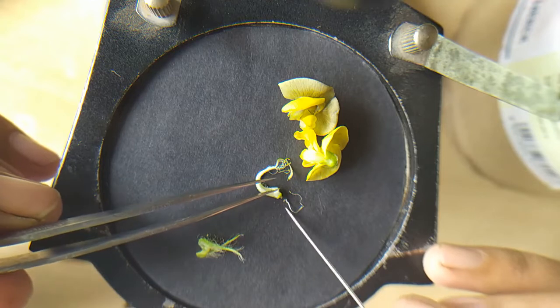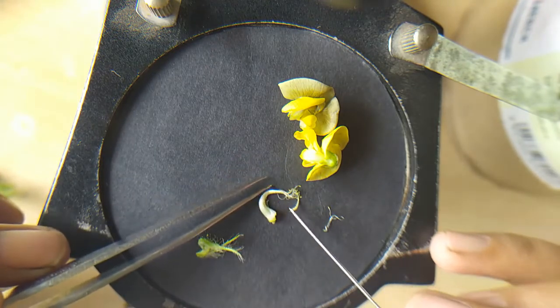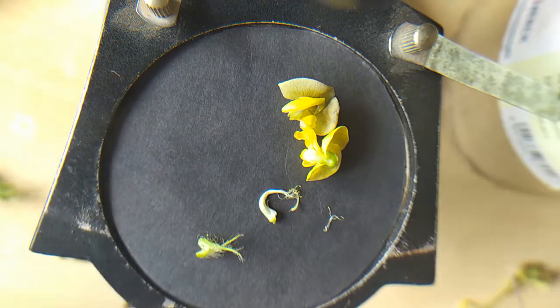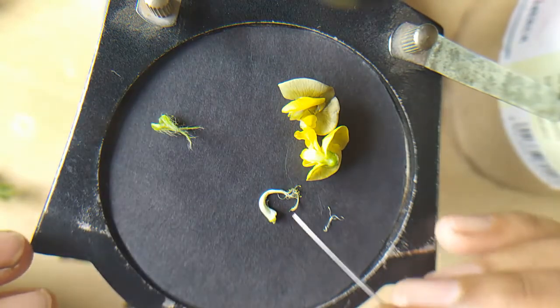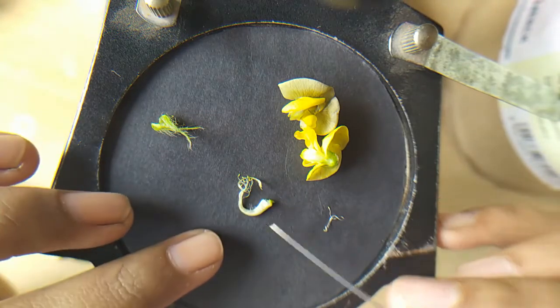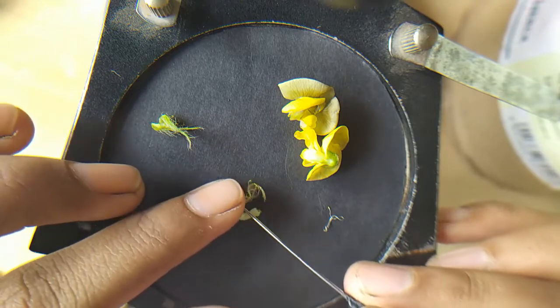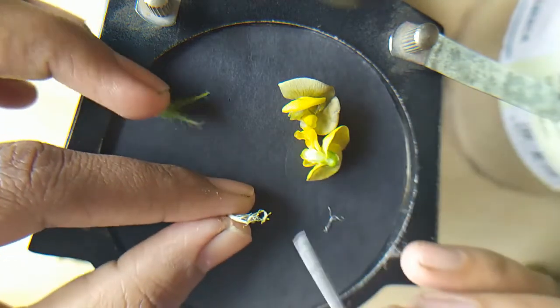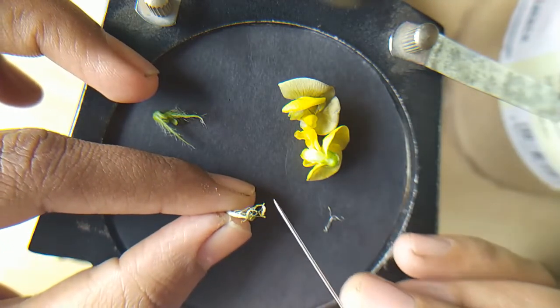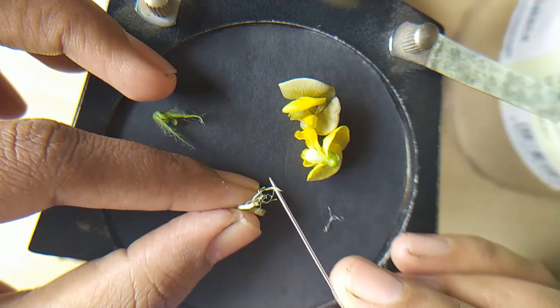If I have separated this, this one is the one anther, and the remaining ones are the 9 anthers. In the bunch of 9 anthers there is the presence of the gynoecium, which is somewhat feathery, and you can identify it because it is somewhat thicker than the anthers. See here, this is the gynoecium.